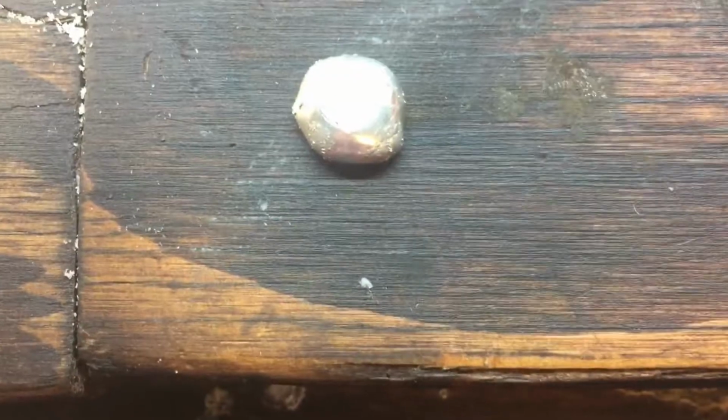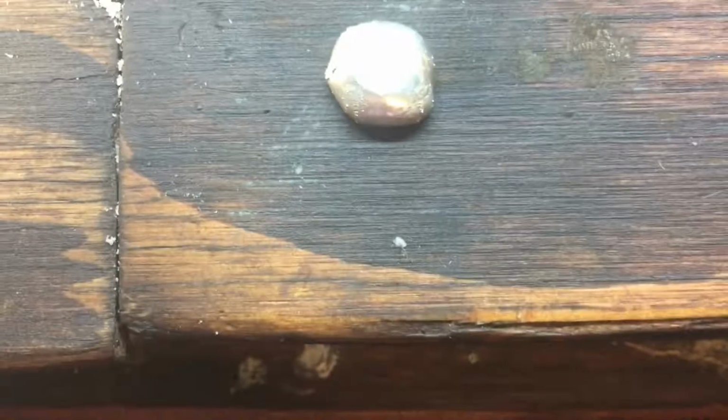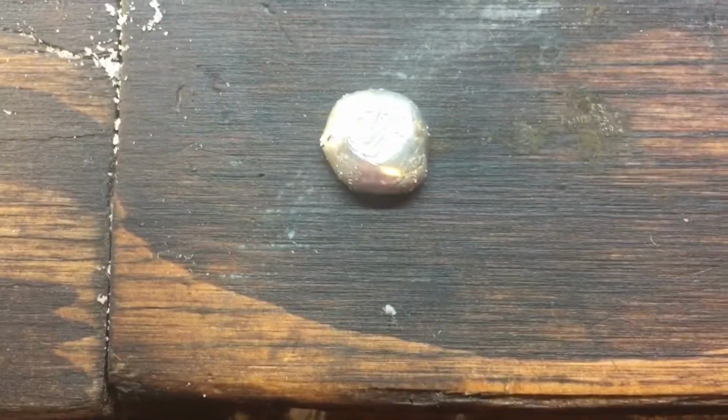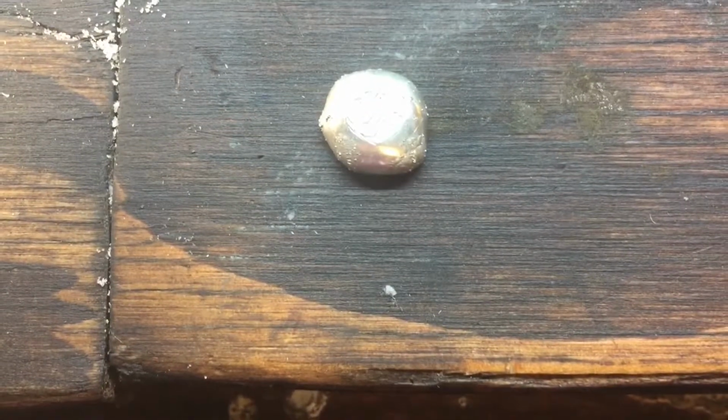And I have more, but this is just a small amount of it, obviously, and I had a lot of fun doing this project. It's really fun purifying metals by making them into salts and then producing them in crystal form.